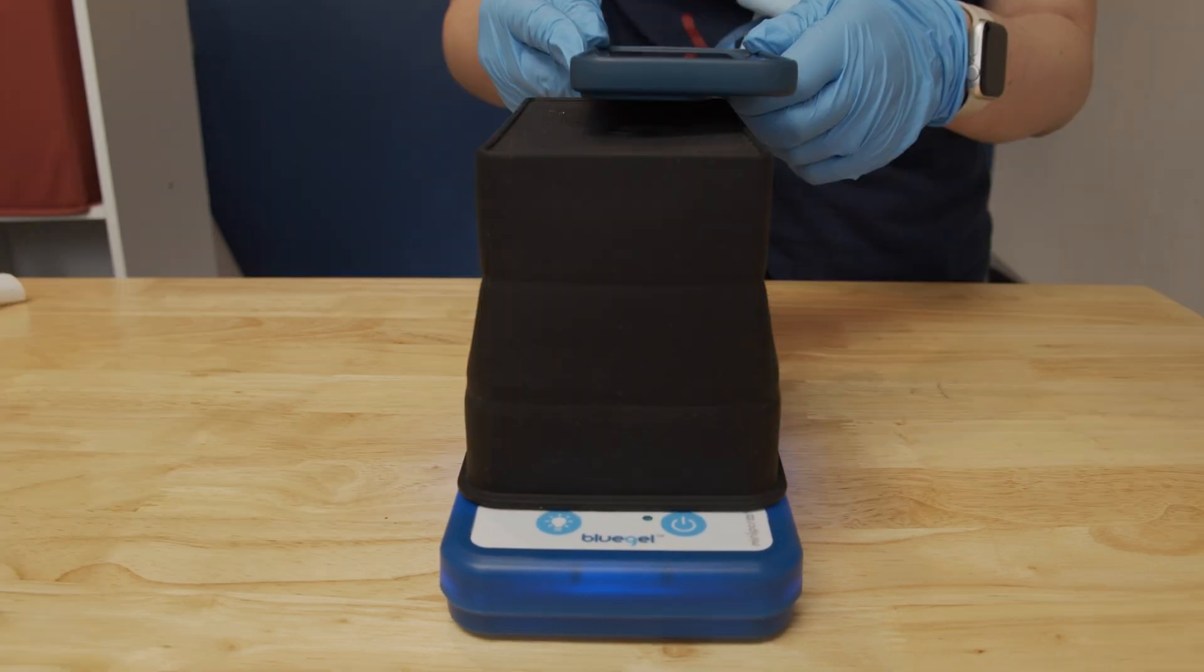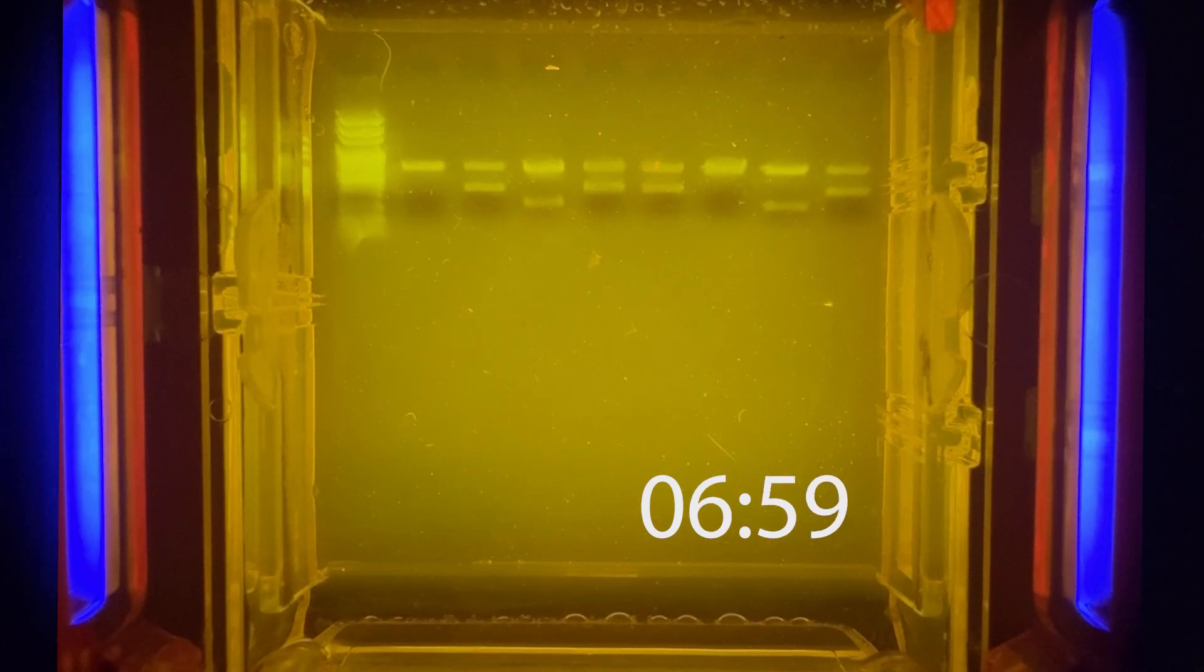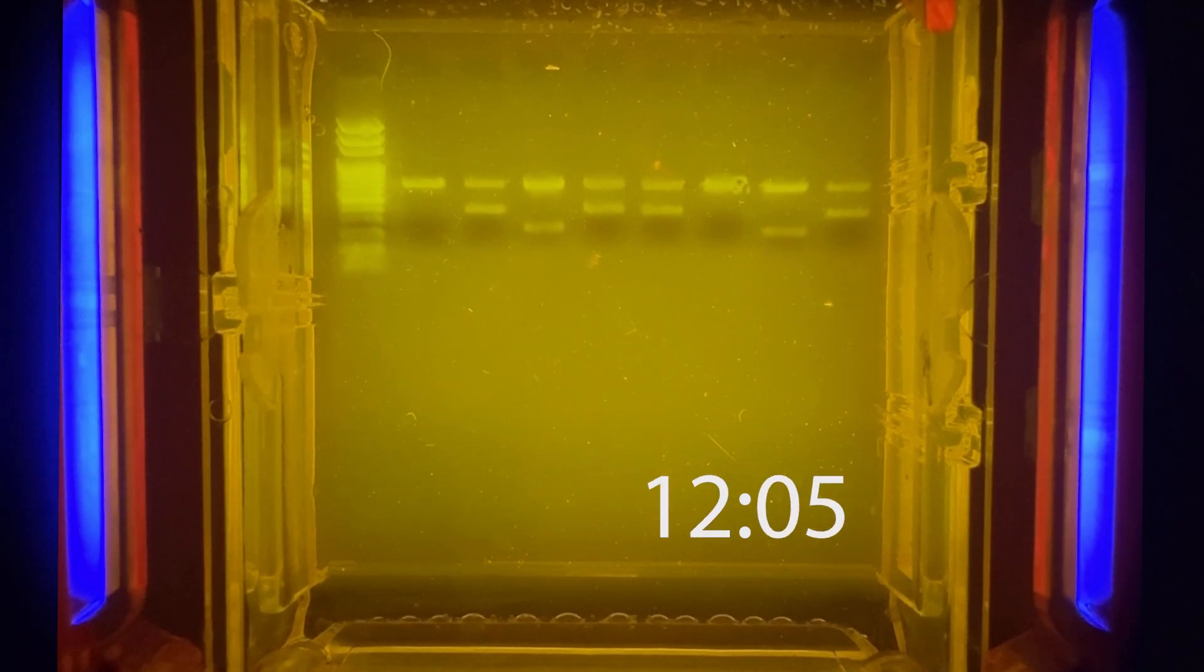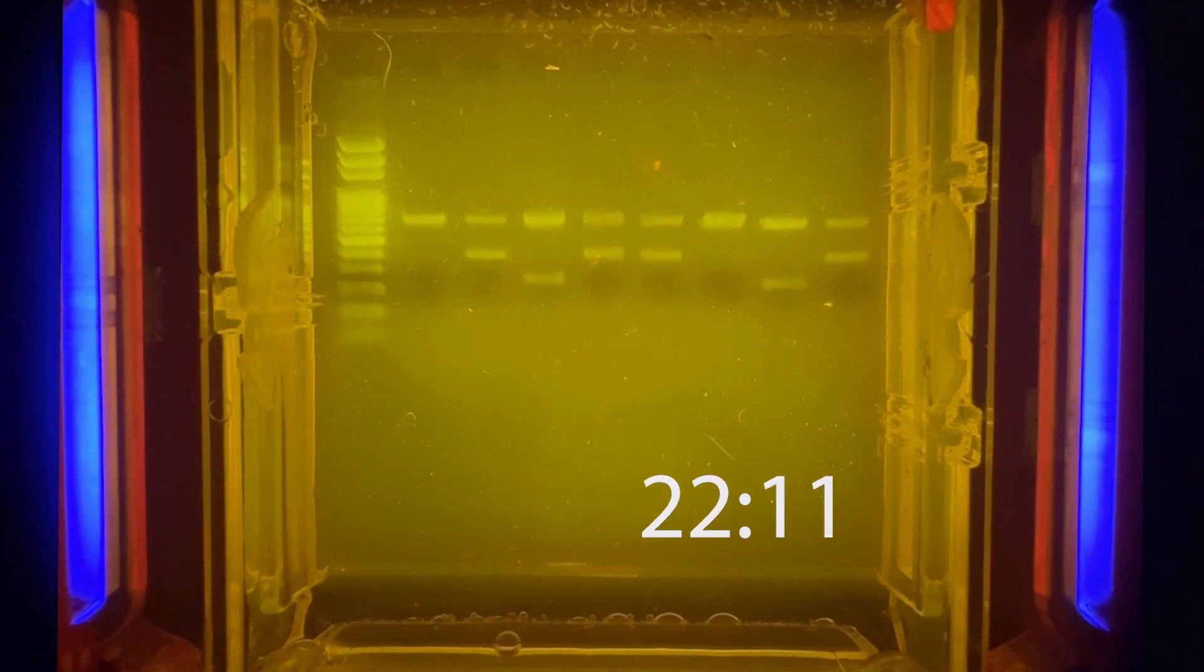Band separation is evident in 5 to 10 minutes, and most experiments can be completed in 20 to 30 minutes. And that's it! The Blue Gel System makes running and visualizing gels simple and easy.